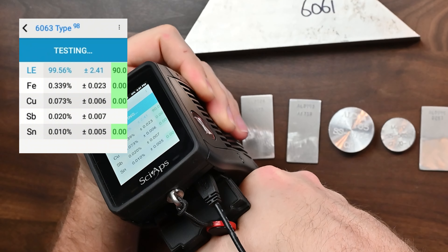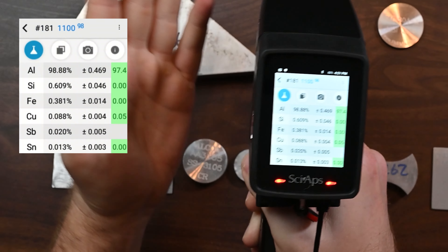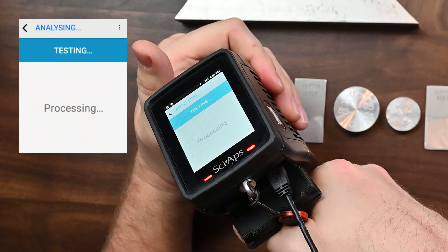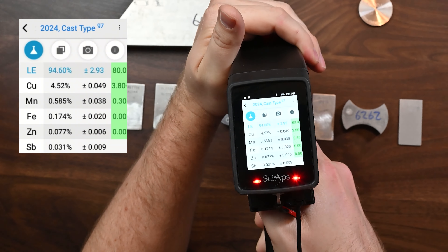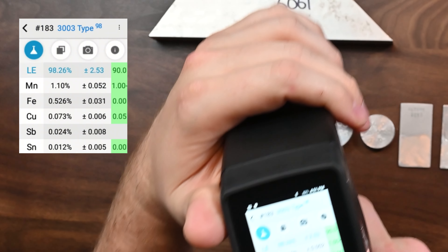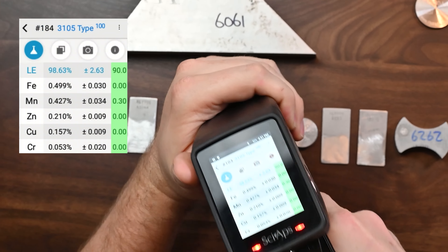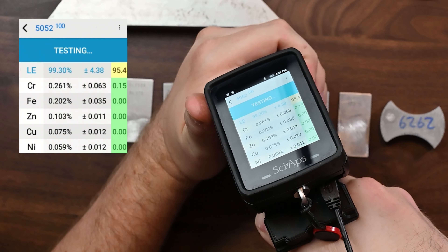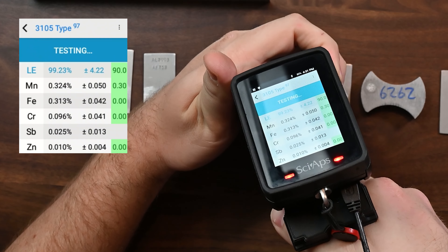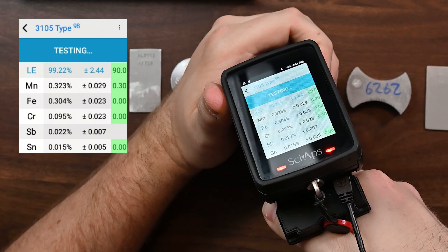If I go back on that 1100 and continue to hold the trigger down, eventually we're going to switch beams, and we're going to pick up 1100 as soon as that light element beam kicks in — and that's exactly what we want to see. That's expected for most handheld XRFs on the market. Alloys like 2024 — just using the heavy beam, we got that one right; we're pretty much looking for copper in this one. 3003 aluminum is next — the most common produced aluminum in the world; it's essentially pure aluminum with some manganese. How about an alloy like 3105? We were able to identify that right away with heavy beam only. But where do we run into trouble? This is 5086 — we read that as 3105. Why is that? Let's take a look at the elements.